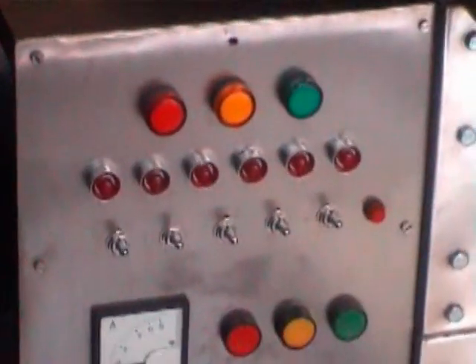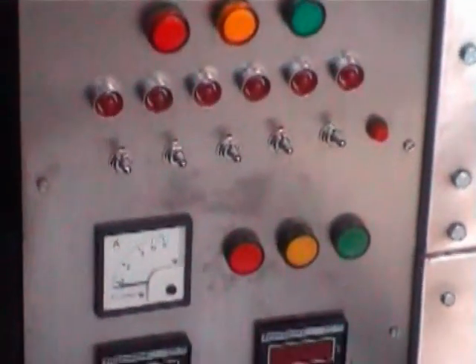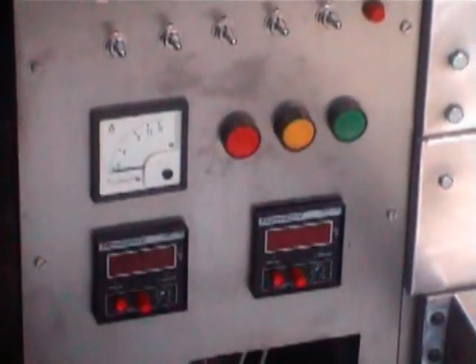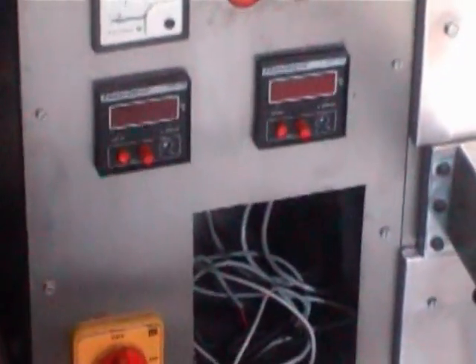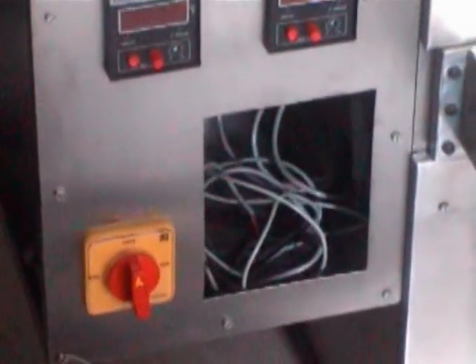This is the control panel where you are seeing the RYB voltage indicator and the electrical temperature indicators, where you can control the temperature. This is the on/off button.